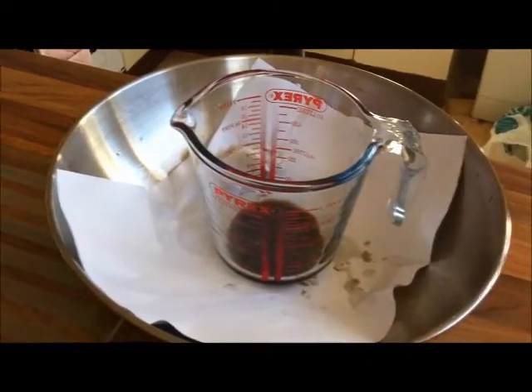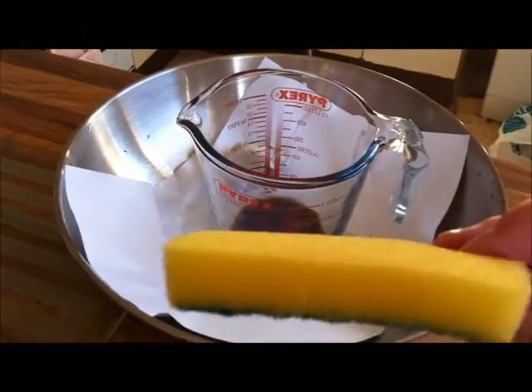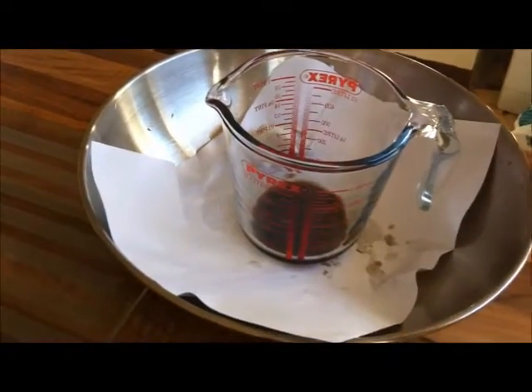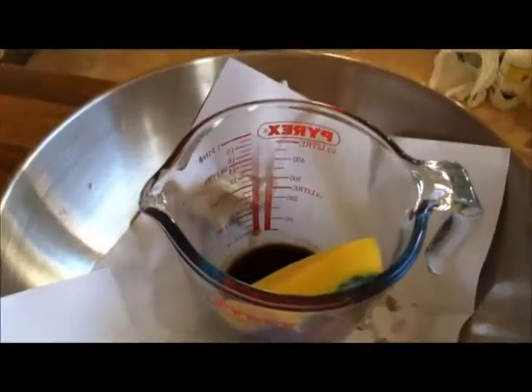So what I'm going to do is drop in this sponge here - just a common household sponge that you use for cleaning your plates - and I'm going to drop it into the acid. And we're going to watch what happens.